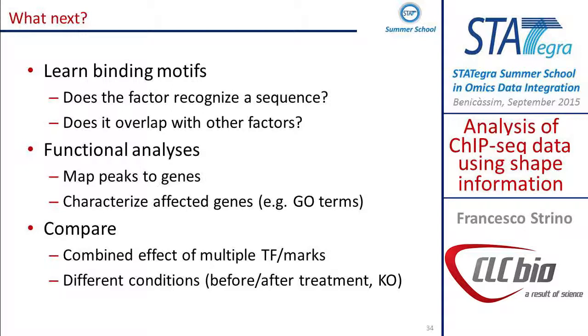And of course, comparing is also something that is quite important. You can look at the combined effect of multiple transcription factors, histone marks, or the common thing, different conditions. So if you have some treatment, you can look at what it looks like before and what it looks like afterward. If you do some knockouts, to see what happened, and so on and so forth.